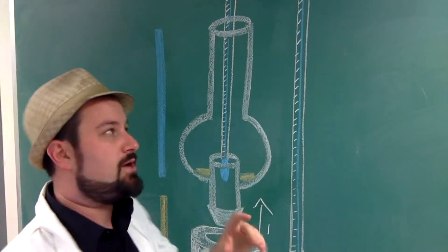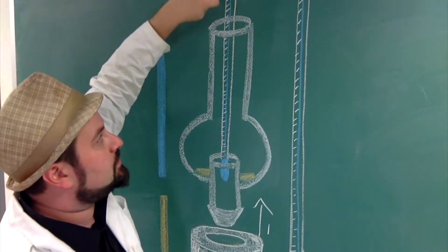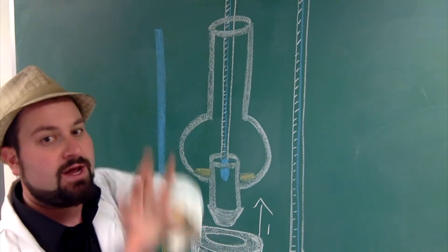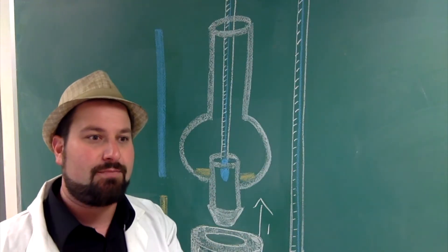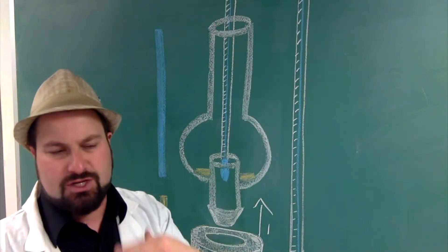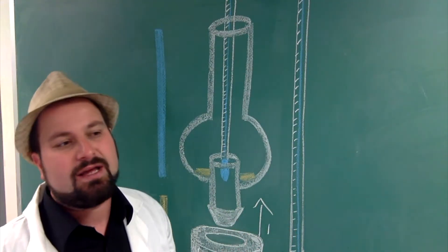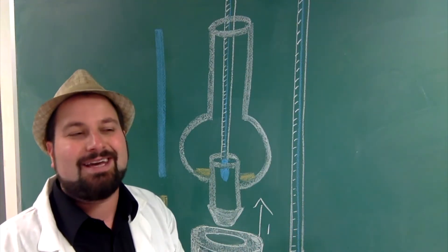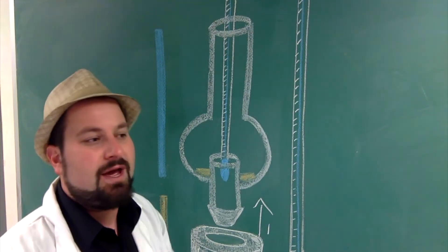Please note: there is nothing stopping the hole in the cap — it is open. The thermometer goes through, but the hole space around it remains open. You must leave that open at all times so you don't create a higher pressure situation, which would affect the boiling point. Also, a closed container that you heat up with a volatile liquid is basically a bomb. We don't want that.